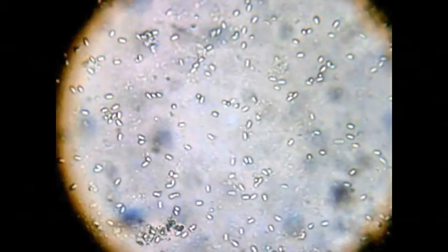The sample shows bad infestation of Nosema. Each of the rice shaped items is a Nosema spore. These are Nosema spores at much higher magnification.